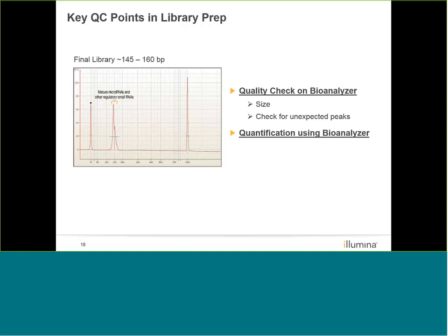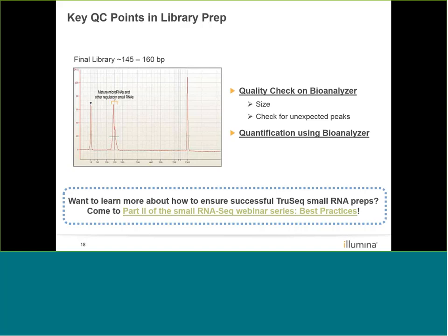If you want to learn more about how to ensure a successful TruSeq Small RNA prep, come to the second part of the webinar. We're going to talk about the best practices.